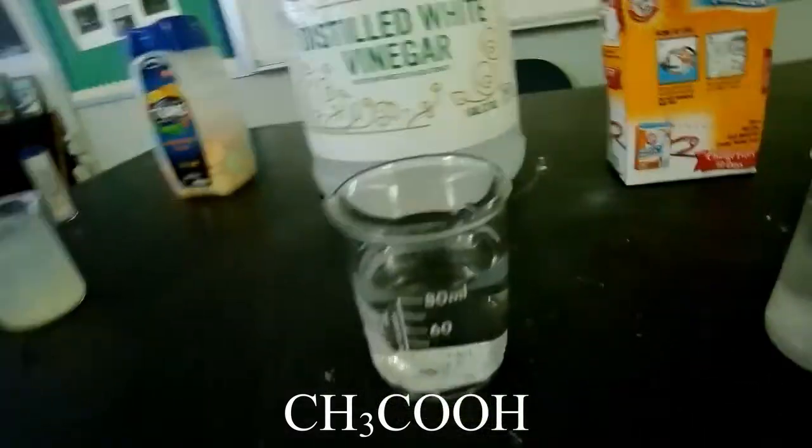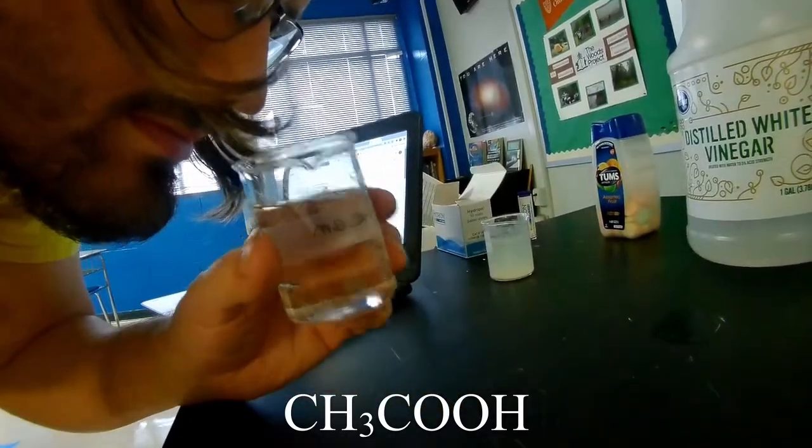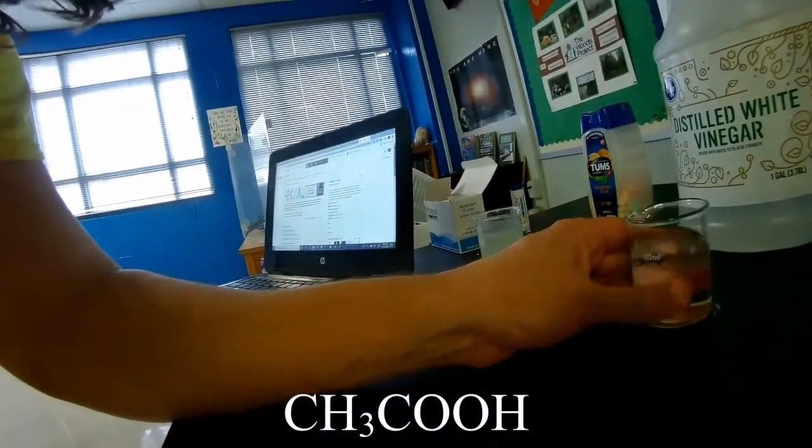Let's see. So we said it's clear. Let's see if it has a smell. Maybe that can inform us. It smells like vinegar. It's a bit sour smelling.